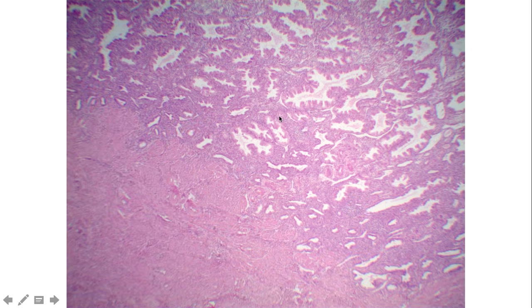And this last slide, this is another one of the uterus, and we can imagine there would have been the lumen up here, and so I've cut the slide off, but the lumen would be out on the top here. So this is the endometrium from here to here, and then this becomes then the smooth muscle layer, the myometrium. And what this one is showing is that depending on the different phases of the uterine cycle, we will have different appearance of these glands. So here we can see these glands are taking on a much more spiral appearance, and that's due to, again, the phase of the uterine cycle.